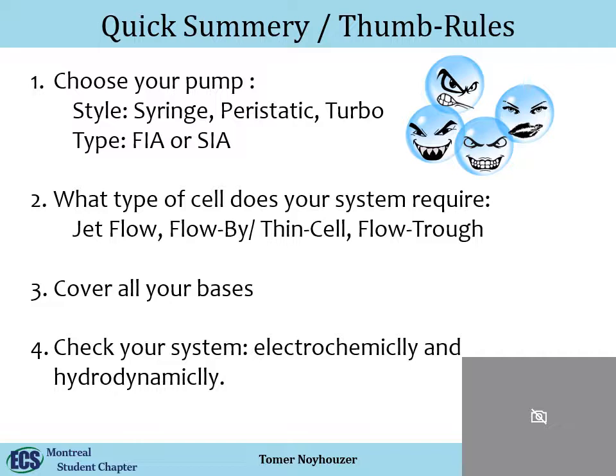And the advantage of a flow-through, and I don't think I said it so far, is that because the liquid flows through the electrode, you decrease the amount of dead volume. You actually increase your surface tremendously, just like Professor Mendler did with the carbon nanotubes. So you usually have a better signal. Those systems are much more efficient, but they're harder to design.